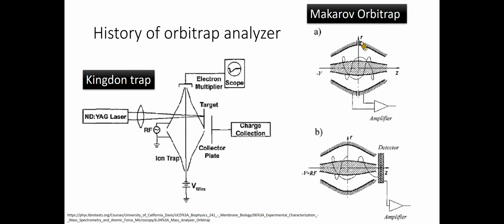The right diagram shows the original design of the Orbitrap invented by Dr. Makarov.